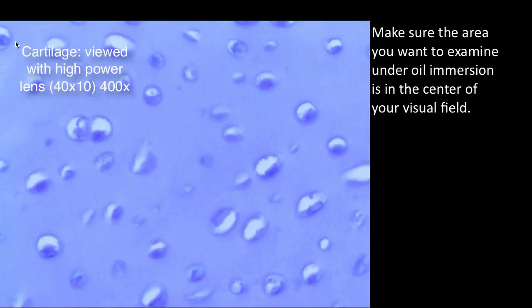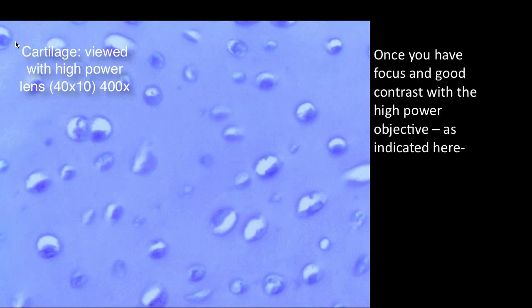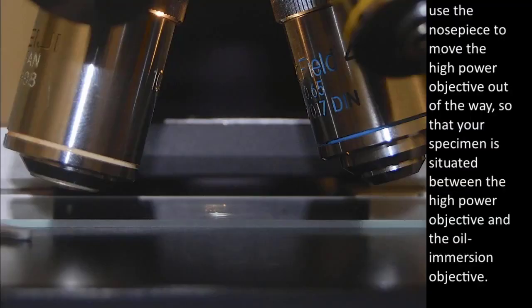Make sure the area you want to examine under oil immersion is in the center of your visual field. Once you have focus and good contrast with the high power objective, use the nose piece to move the high power objective out of the way so that your specimen is situated between the high power objective and the oil immersion objective.